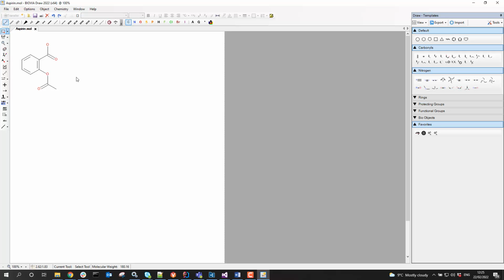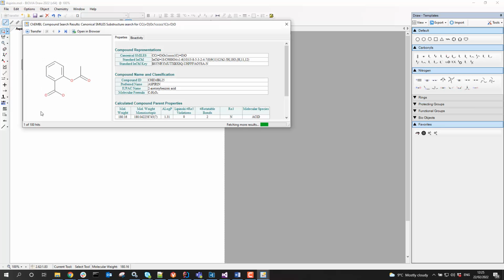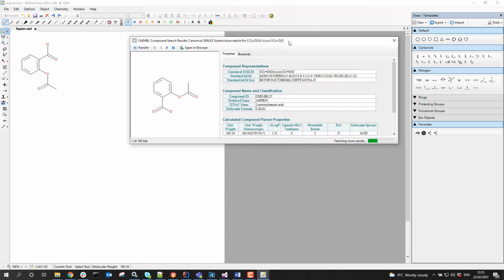It's fetching quite a lot of information usually, especially when I use aspirin, as you'll see when the dialog arrives. There we go. Sometimes it's a bit quicker than that. That was a bit slow. I was actually starting to get slightly worried.